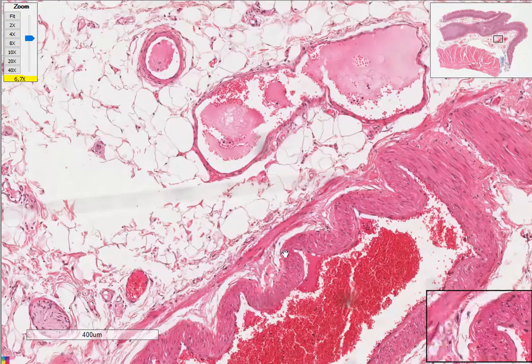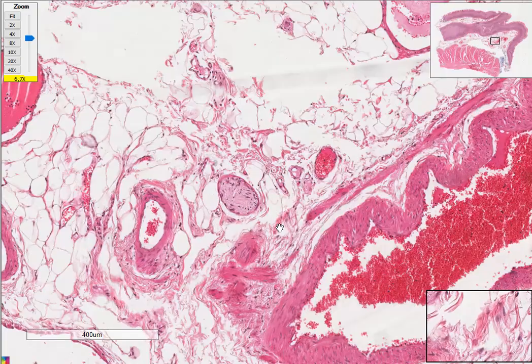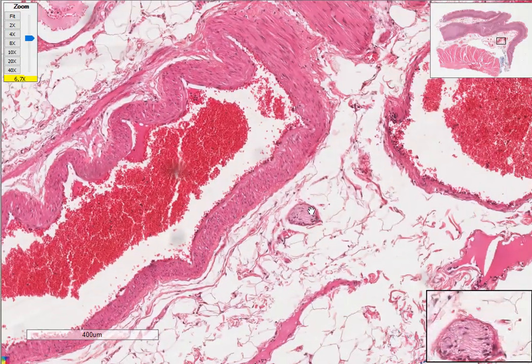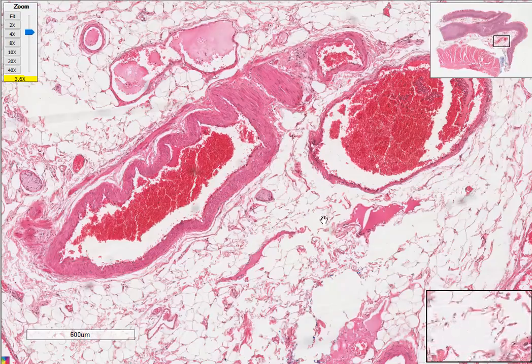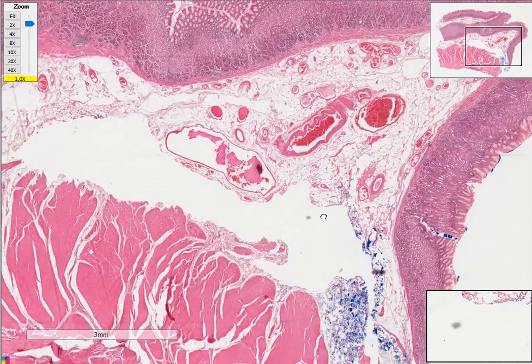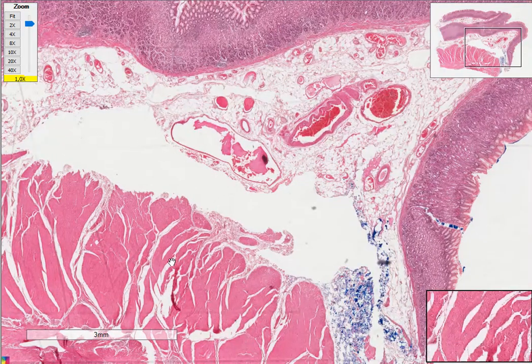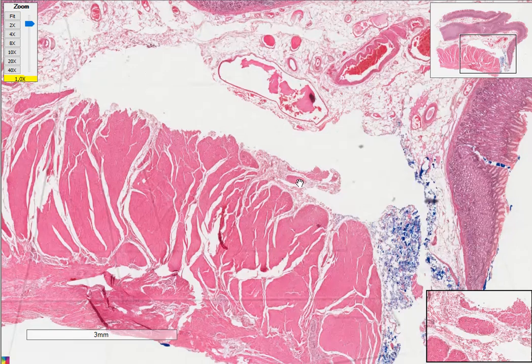So you get to see multiple nerve tissue. Like here, this is nerve tissue I'm highlighting, which could be part of the myenteric plexus as well. And they are involved in churning, which helps the muscularis externa of the stomach, which I will now begin to talk about.